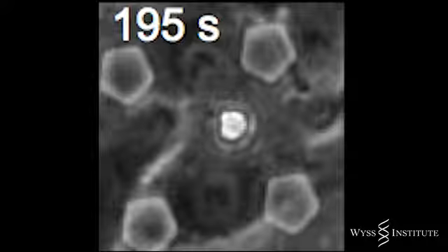Here is a magnified view showing a migrating white blood cell making its way through the first capillary cell layer, wriggling through the pentagonal hole in the flexible membrane, and then moving out of focus to the other side. When viewed from the air channel, with all cells visible, you can see a round white blood cell popping up from below. Just like in a real lung infection, the white blood cells, which are now colored red, engulf and kill the green bacterial invaders.